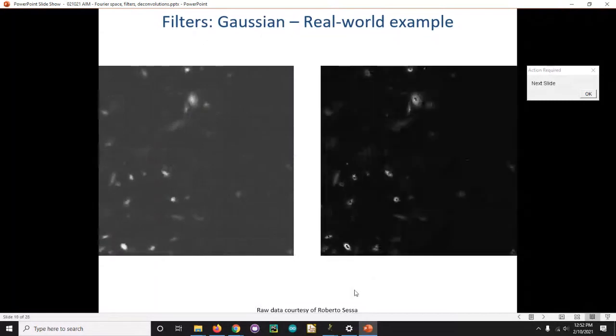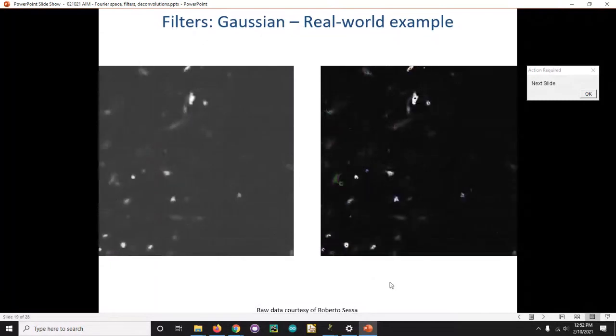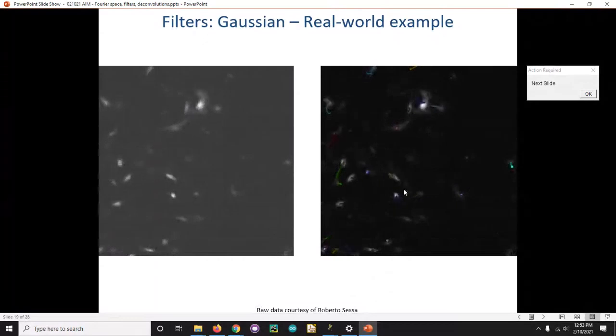By doing that, in the end we're able to come up with a tracking algorithm that can track all these cells. This would be entirely or nearly impossible without that blur, but by making the cells equally blurry in every single frame, now we can segment them out.